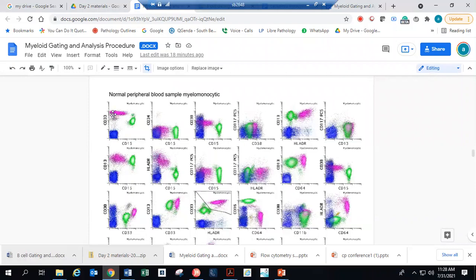They could be basophils over here, because as we know, the basophils can also lie in this place. And basophils can have CD38 also. So that's what I was thinking too. Maybe. Okay, good.